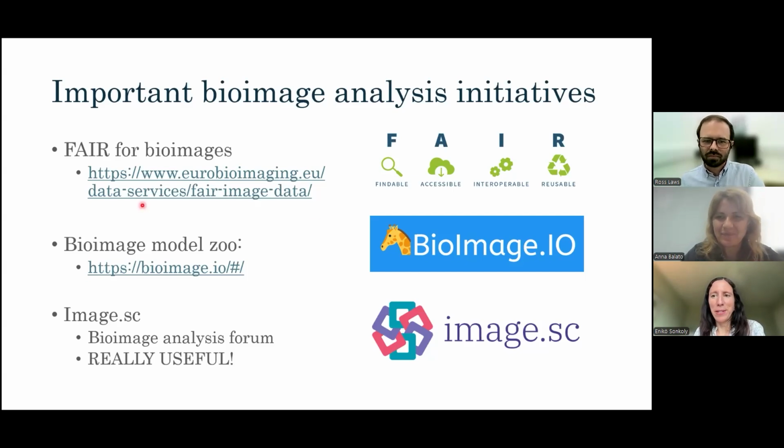While we are still waiting for some questions, I may ask you, because we had a previous episode, some time ago, on cryo-electron microscopy, which is another technique which people have been talking about because also of the Nobel Prize. So my question is, when would you use one or the other technique? Of course, both have their advantages, disadvantages, and their special areas of use.